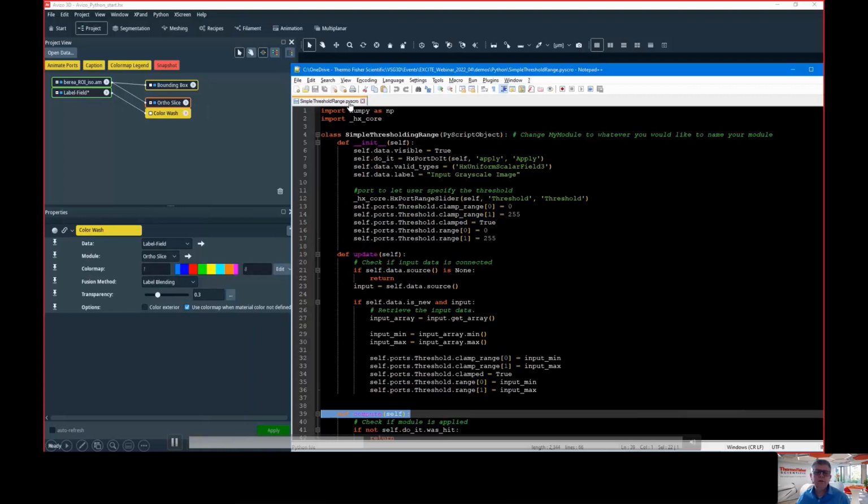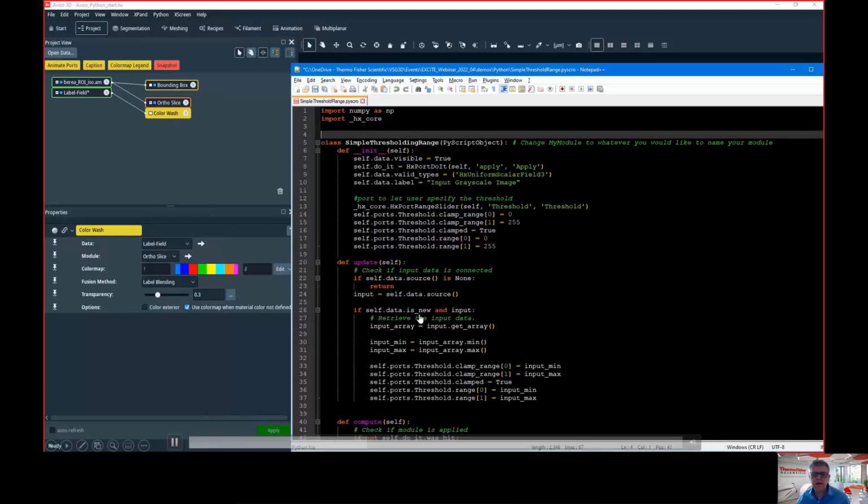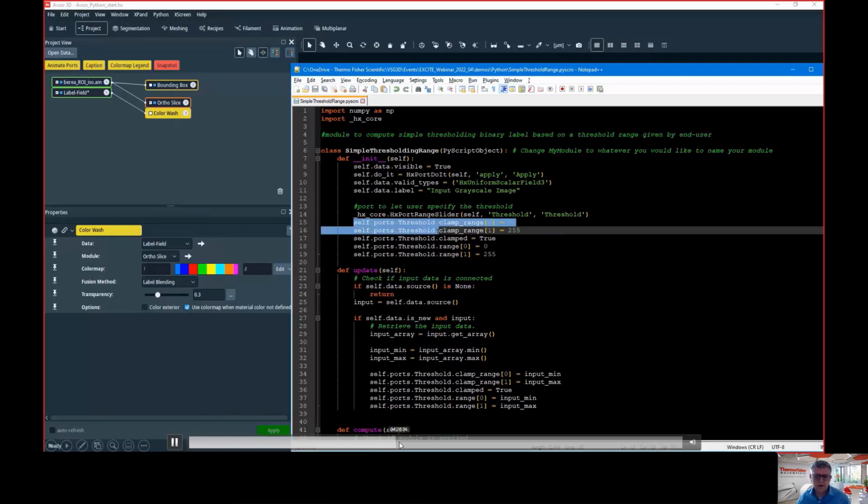So let's say I create this script because I read the documentation. Somebody sent me this script anyway. So I learned how to do this in a training. We do training, of course, to learn how to do this. But you have plenty of resources I will show you to learn yourself. You're not obliged to follow a training.